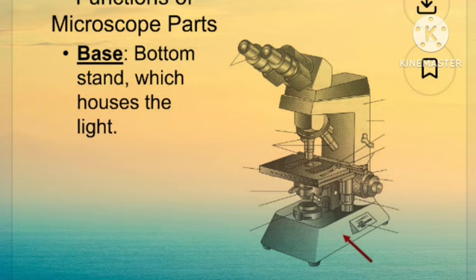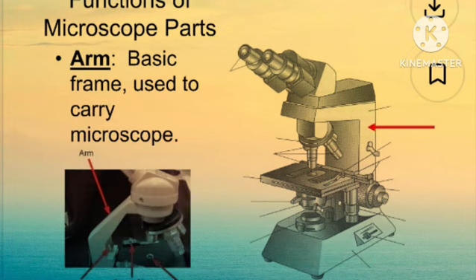It provides structural stability. It is heavily weighted to prevent the microscope from vibrating and shaking when focusing at high power.